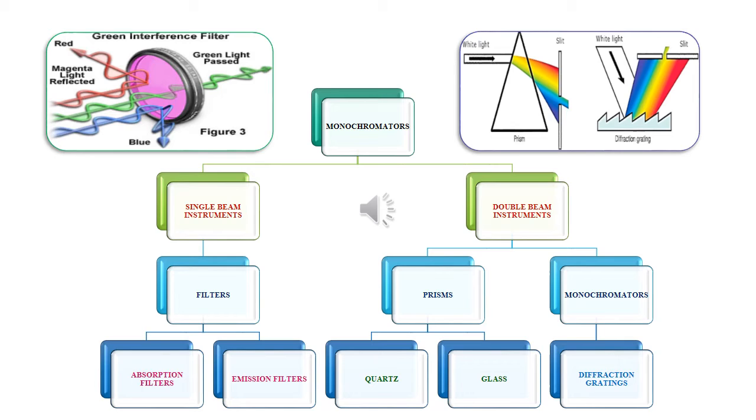And next, coming to the prisms, you can find the picture on the top of the slide, where the prism functions like a dispersion process. It disperses the light it receives from the source into individual wavelengths, where white light comprises of all multiple wavelengths, that is polychromatic light. White light represents polychromatic light, where colored light represents dispersed light or monochromatic light. So prisms function like a dispersion process.